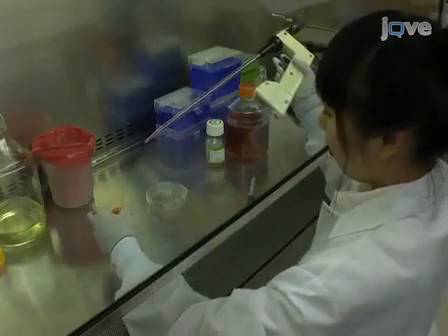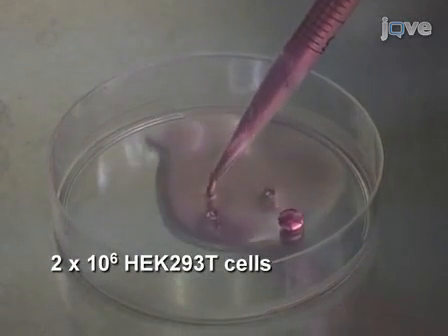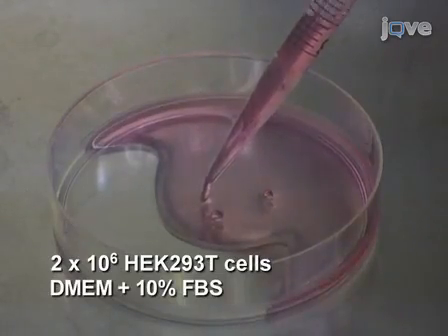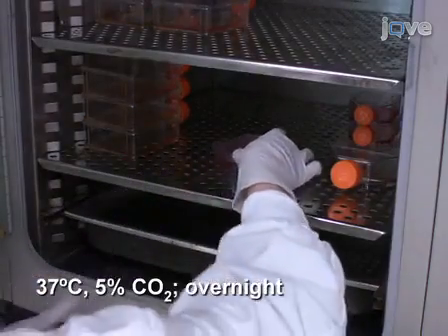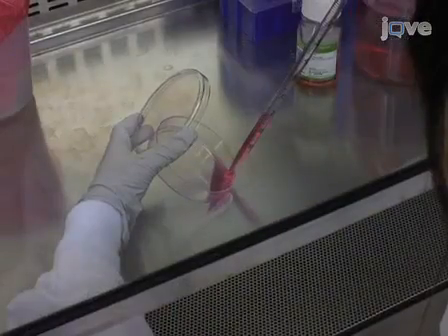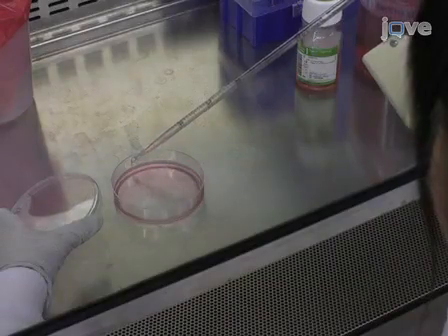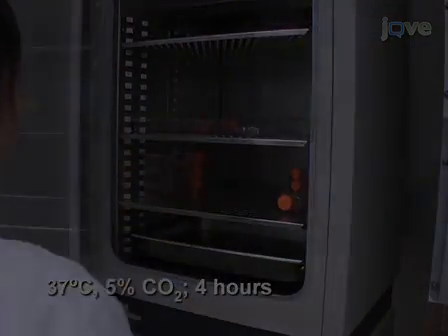1 day prior to plasmid transfection, seed 2 × 10⁶ HEK293 T cells in 10 ml of medium in a 100 mm Petri dish. Grow cells overnight at 37 degrees Celsius, 5% carbon dioxide. On the following day, replace the supernatant from the cells with 5 ml of fresh medium, then continue to culture the cells for 4 hours at 37 degrees Celsius, 5% carbon dioxide.